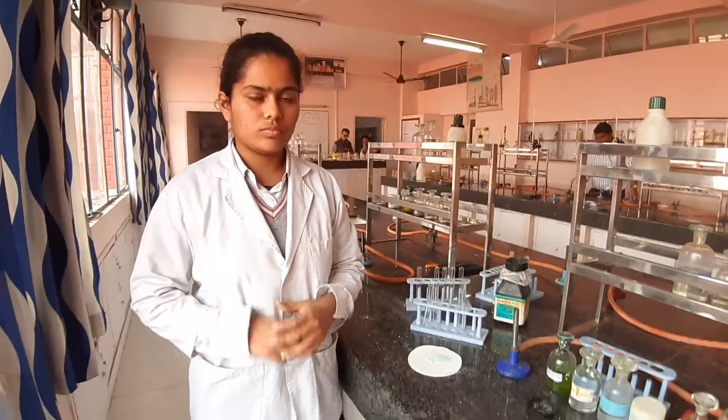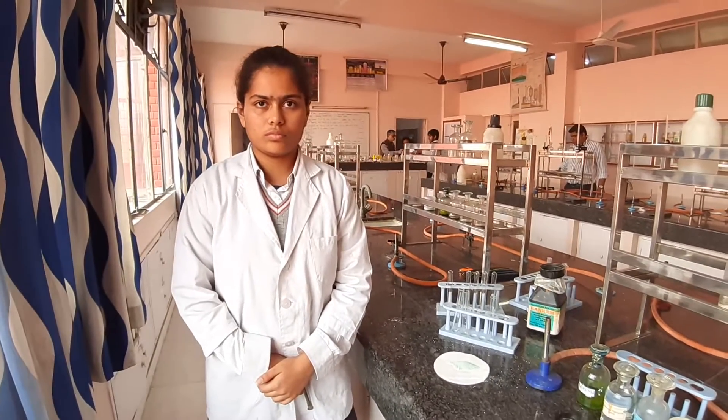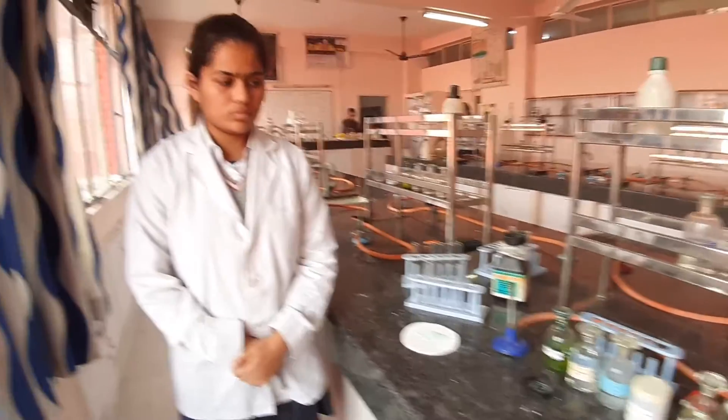Very good morning students. In today's class we'll be doing the lab test for iron, that is ferric ions. Now I would be using ferrous ions, but your aim in class 11th as well as 12th is to test for ferric ions. So at some point we will also be oxidizing them. For doing the test I have my student Nikita; she'll be performing the test for today.